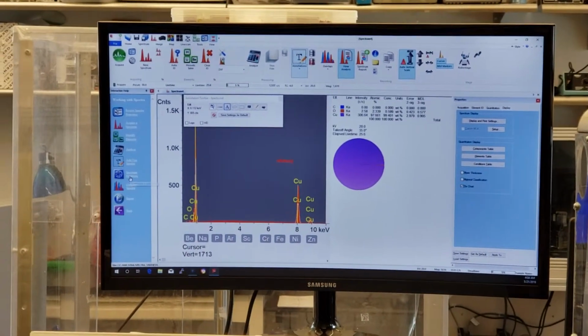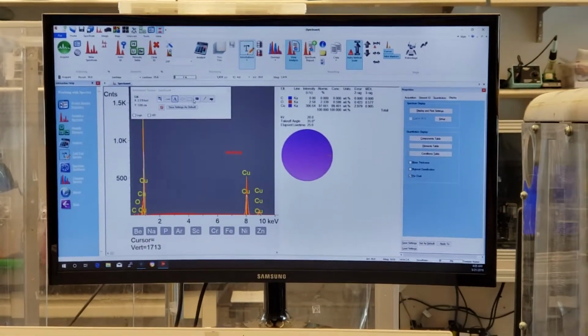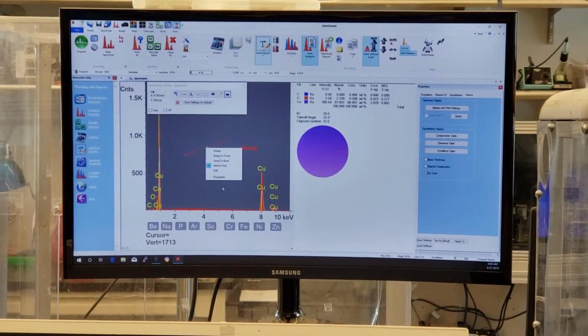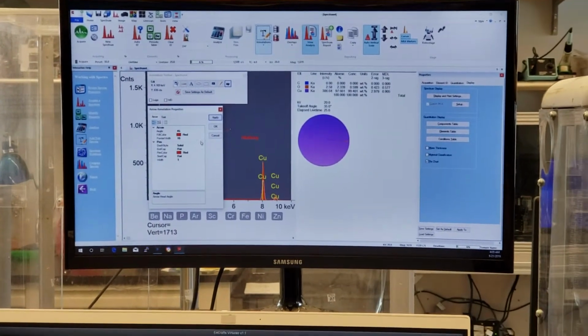The next thing in this flowchart is spectra synthesis. Well, this is also in the text window. You could also point to stuff, like get an arrow. If you right click on the arrow, you can look at its properties. You can change the angle of the arrow, the size of it, the width of it, all sorts of stuff there too.